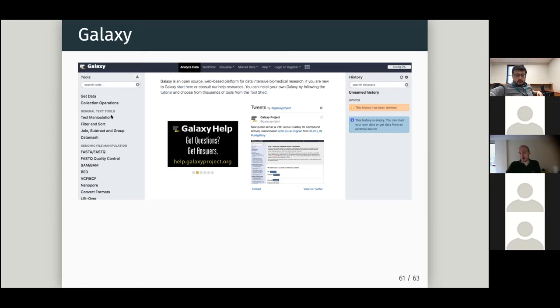Of course, the reason why we're going to use this web interface is that if you're not familiar with the command line, running these tools yourself is more complicated. And the whole session is going to be about assembly. So we're going to assemble the genome. But at this point, what is more important is to understand what we're dealing with, because running a single tool with a bunch of options and getting the results sometimes is not that simple, but most of the time is not particularly complicated.